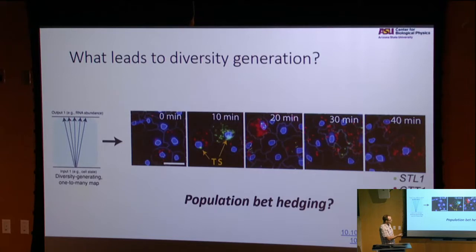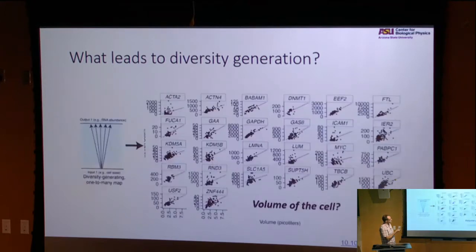This is in yeast, and this is a paper that came out in 2019. What we figured out is that if you pair this with really careful statistical models, you can actually predict what the populations are going to do as a whole. But what you need is a very good count of these dots per cell. And so what does that look like? That looks like this, where you've got this gene, this gene, this gene, and then you have to count those per cell.